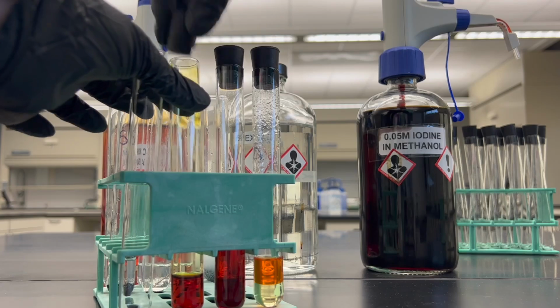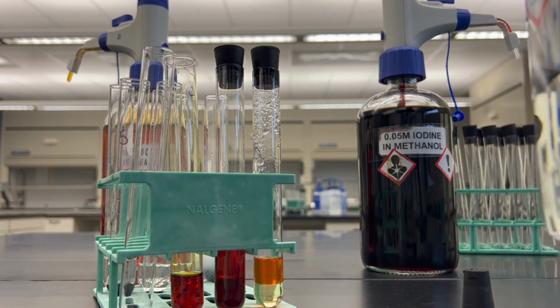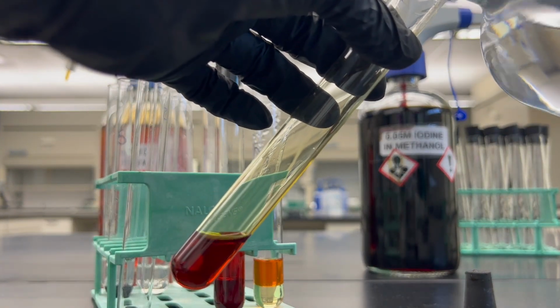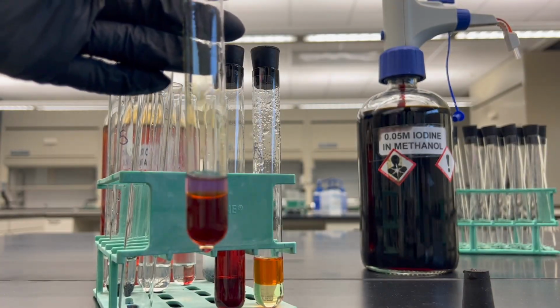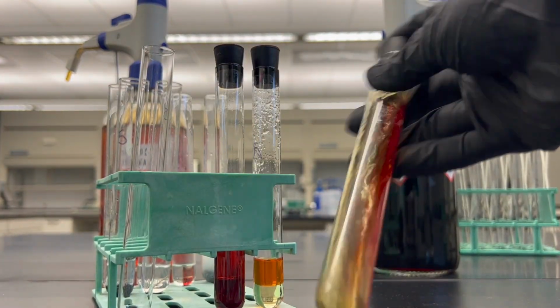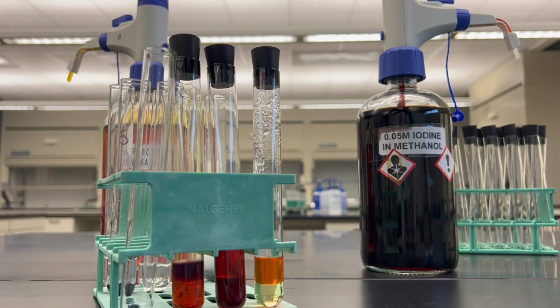I'm then going to add some hexanes to it so that it can form its layers. And we can compare. I'm making a mess. I'm gonna let that settle.